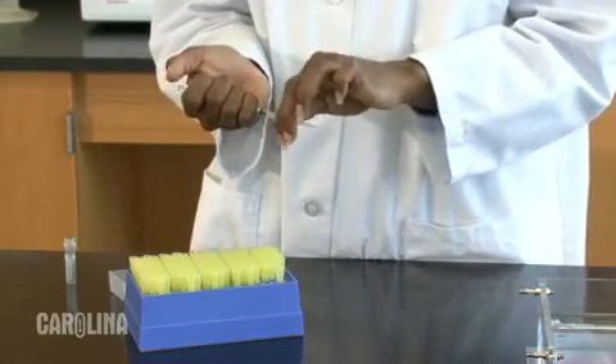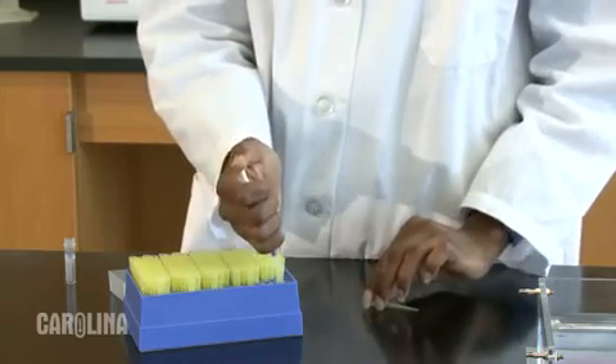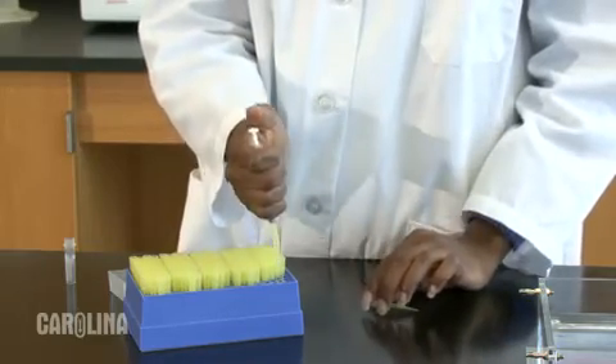One final reminder: make sure you use a new tip or capillary tube with each sample — this will help avoid cross-contamination. All of these gel loading devices, as well as a practice pipette and station kit for practicing these skills, are available at carolina.com/biotech.